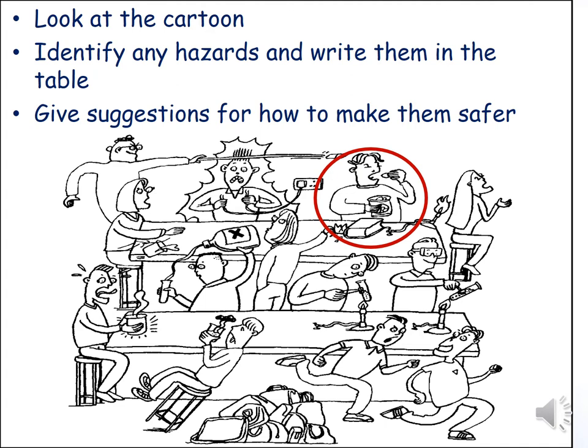Well, in science, we use lots of different chemicals when we're carrying out our practicals, and some of these chemicals are actually harmful to us. So we have to be very careful when we are handling them. If we've got some of these chemicals on a table, for example, and we do wipe our tables down, you might have parts of the chemicals still left on the table that you missed. If you're touching the table, touching your exercise book, moving things around on your table, and then taking out food and eating it, and putting your hands in your mouth, if you have some of that chemical on your hands, you are going to ingest that, and it could be harmful to you, it could make you very sick. So we do not have any food or drink in a lab.